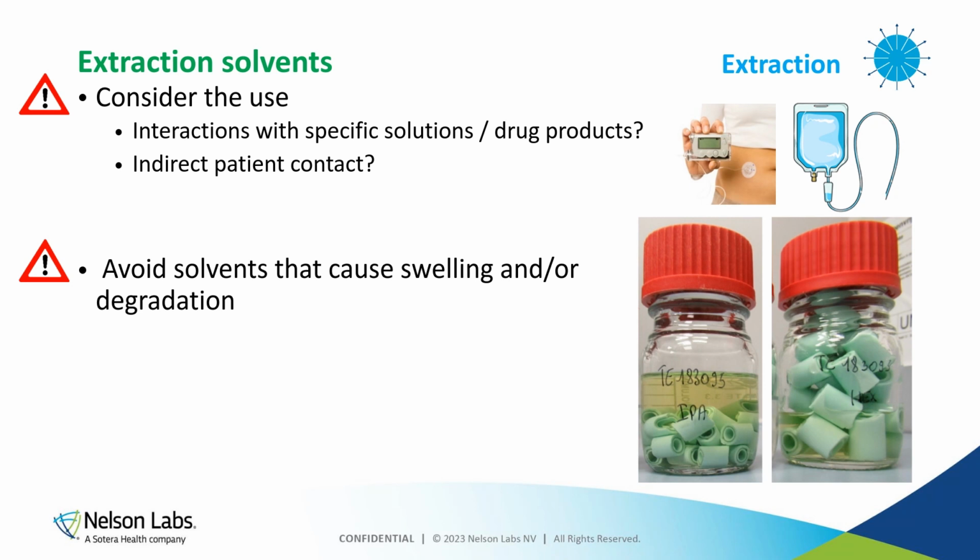And then lastly, you need to avoid solvents, as can be seen here, that cause huge swelling and/or degradation, as you will obtain in that case an extractable profile that is not representative for patient or user exposure.